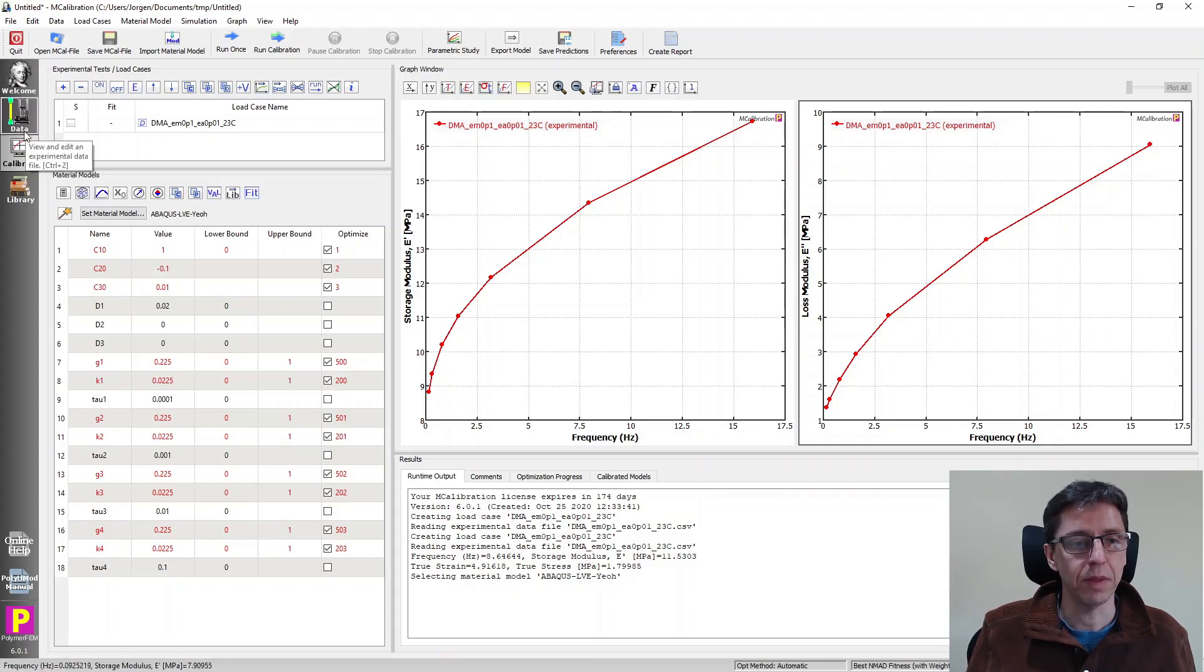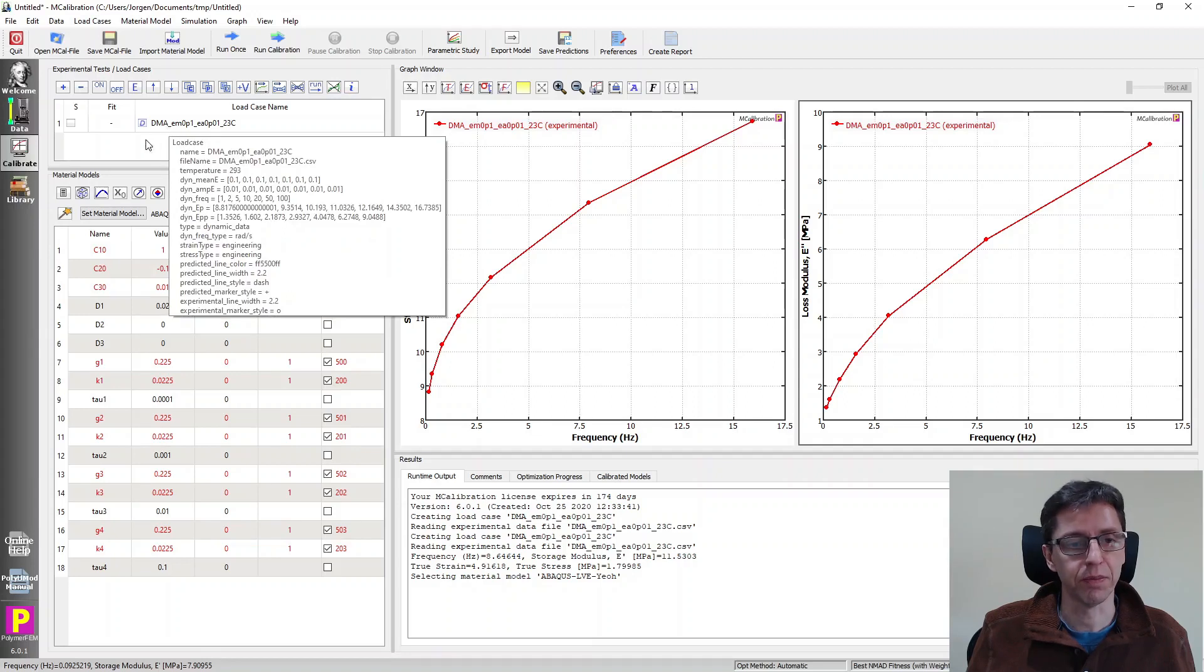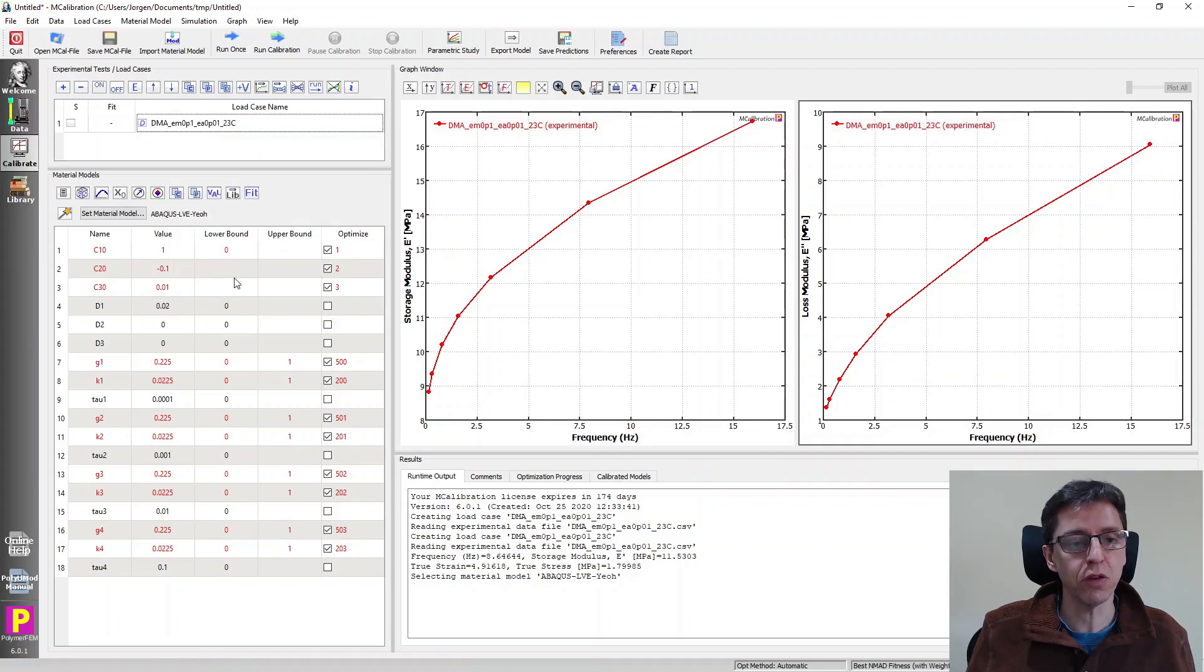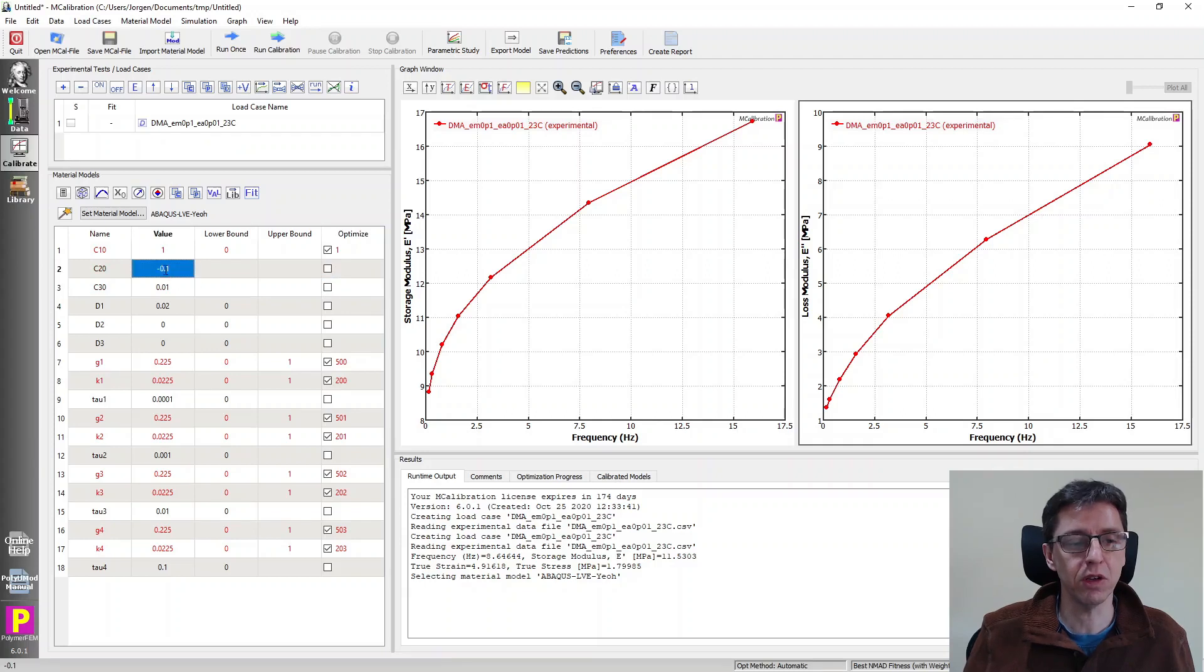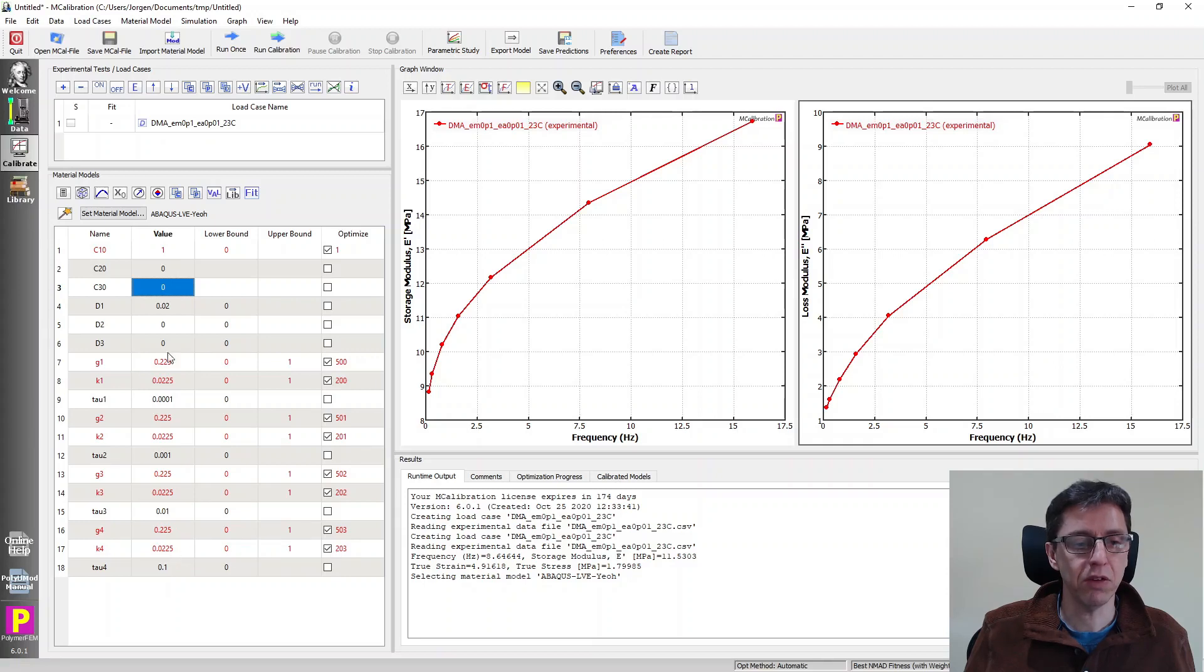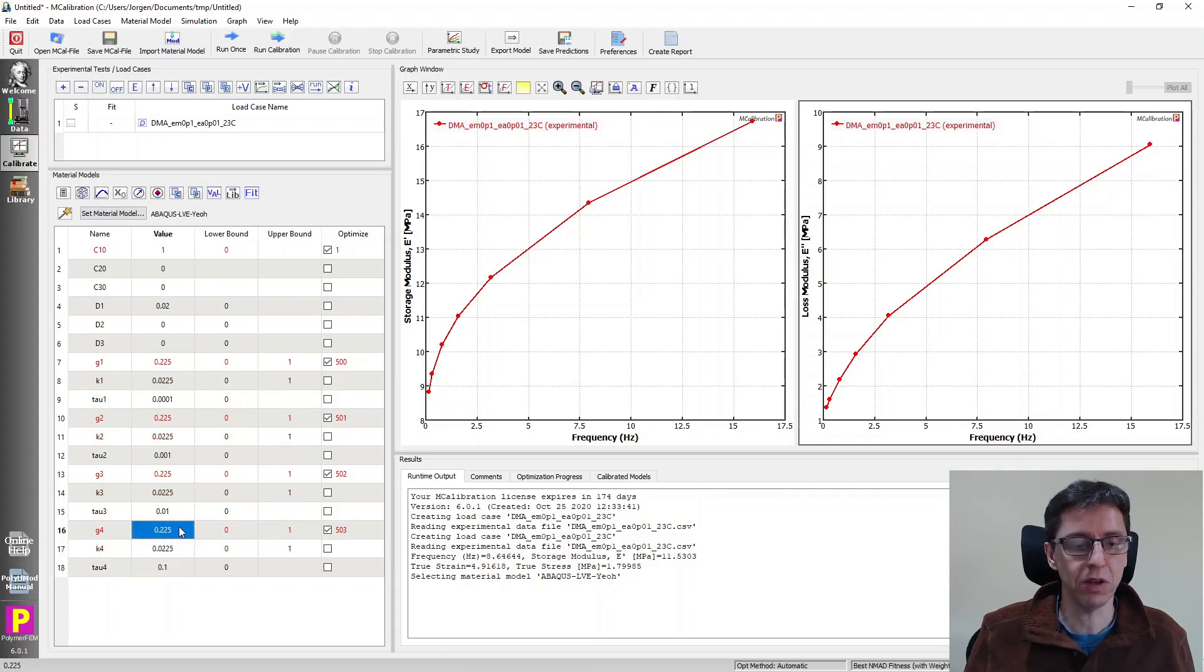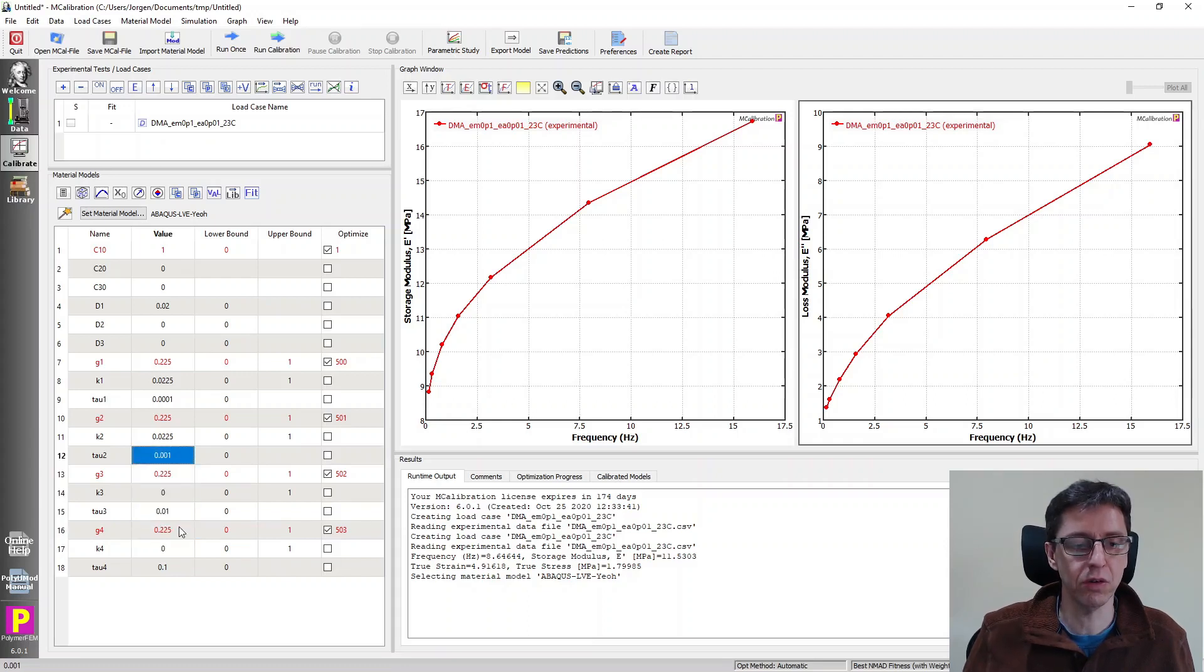In this case, the data goes to very small strains. So there is no need to calibrate the non-linear terms in the neo-Hookean hyperelastic model, so I'll make those zero. And then we have the volumetric. This is a Prony series with shear relaxation and volumetric relaxation. For simplicity, in our example, I'm going to deactivate the volumetric relaxation. I'm going to make the k term zero.